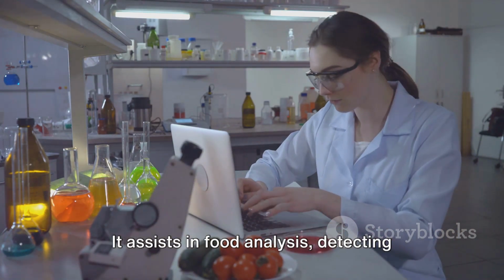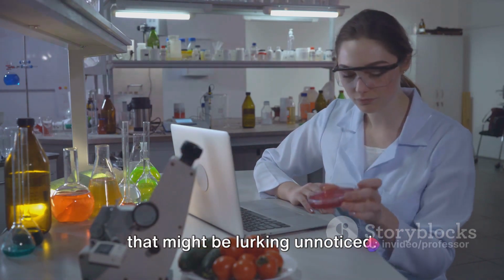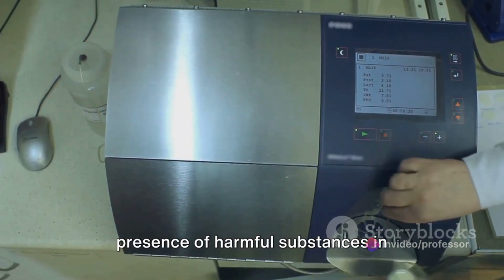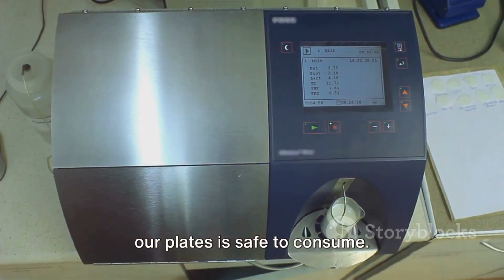It assists in food analysis, detecting any potential contaminants or adulterants that might be lurking unnoticed. From identifying pesticide residues in fruits and vegetables, to checking for the presence of harmful substances in processed foods, HPTLC ensures the food on our plates is safe to consume.